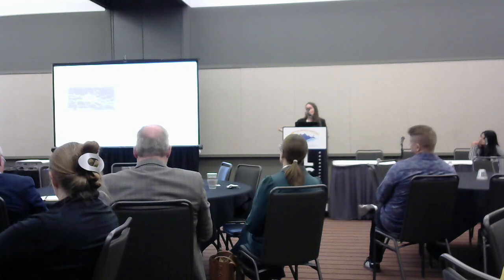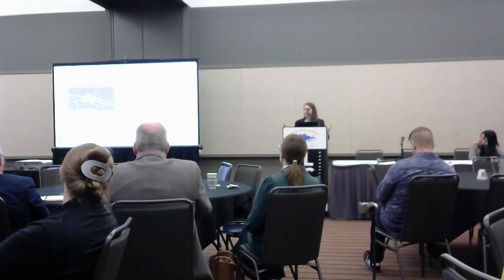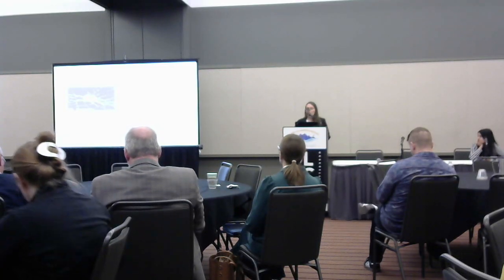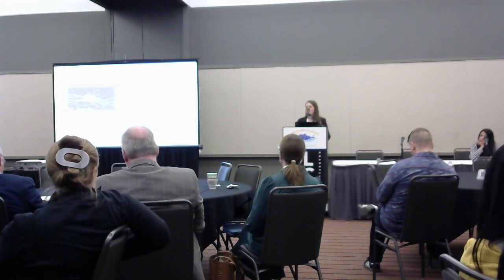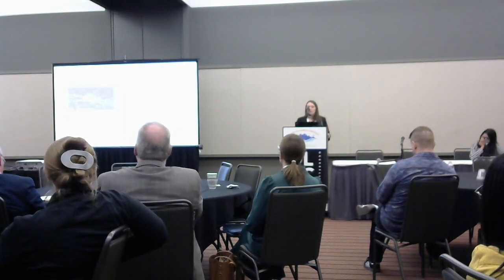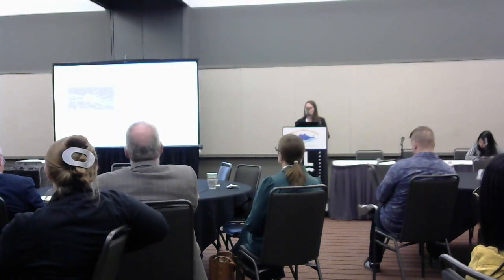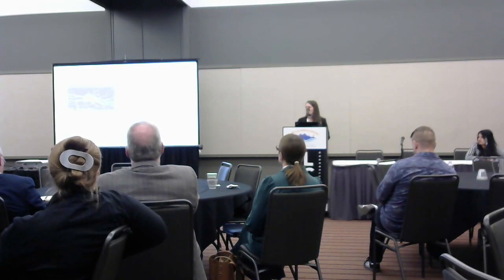Another thing is open source versus proprietary. So I'm a huge proponent of open science, so moving towards open source software if you can is a great choice, but sometimes that is a limitation. You have what you need in a proprietary software that your institution has purchased. So for these, Imaris is not open source, but the others are. So for this particular task, I might narrow down the software choices to these 3, for example.